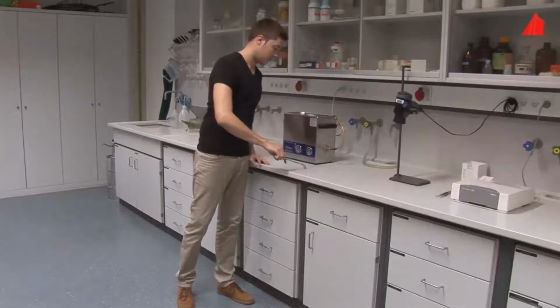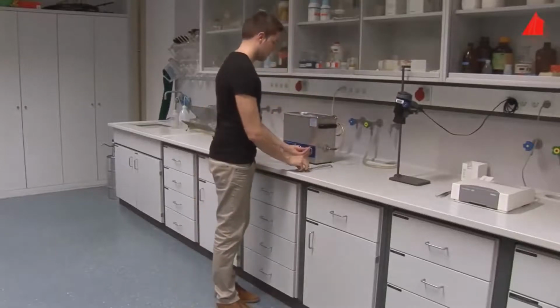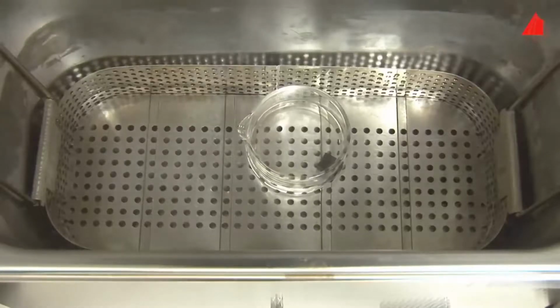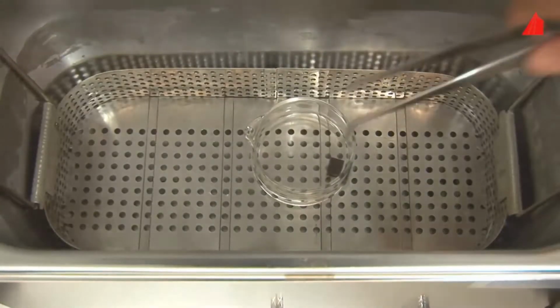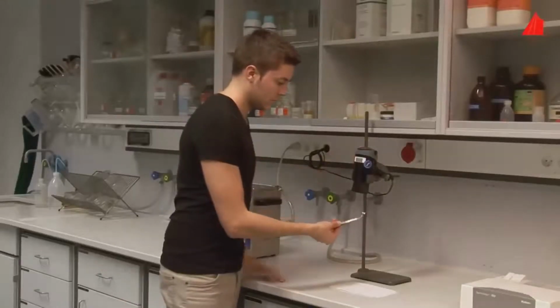To ensure that the resin will adhere well to the specimen surface, the specimen is placed in an ultrasonic cleaner bath for a few seconds. Alcohol and ultrasonic waves help to remove fat and loose particles from the surface. A short time under the hairdryer and the specimen is clean and dry.